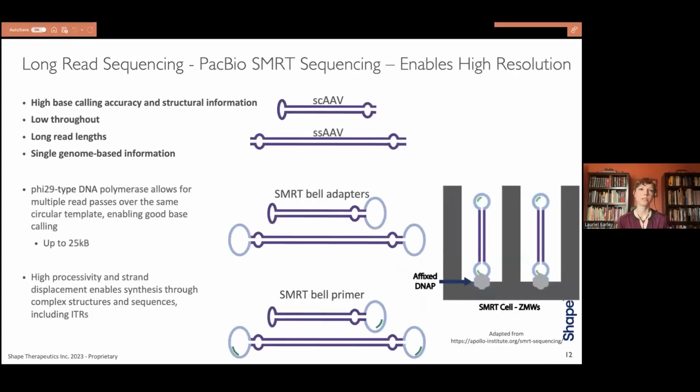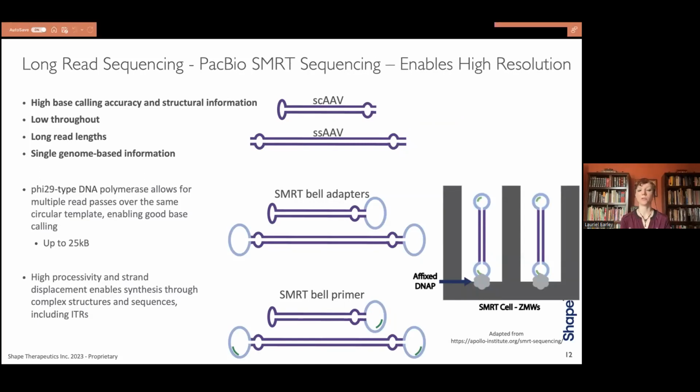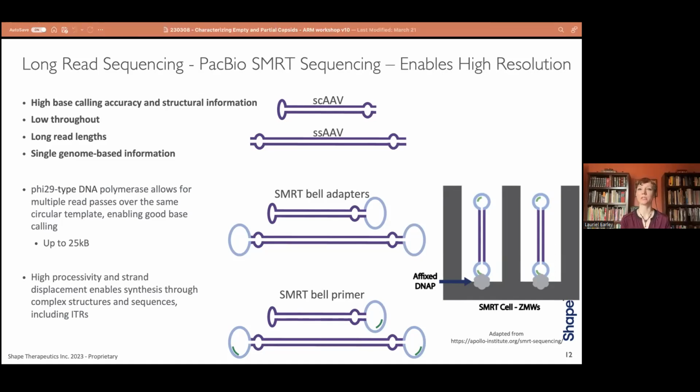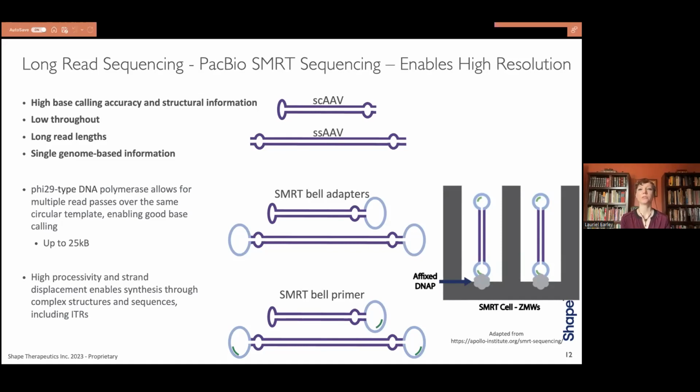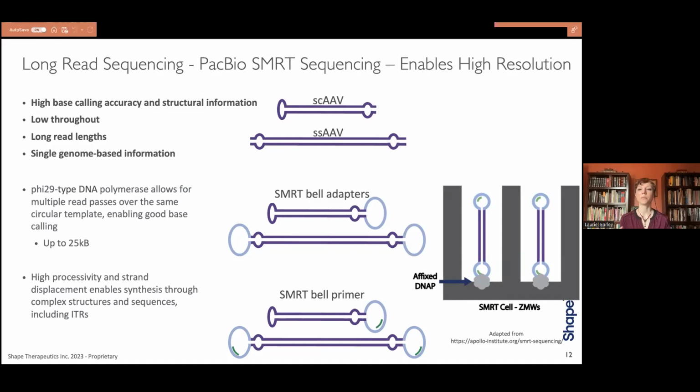The other long-read sequencing technique that I'll actually talk quite a bit about is PacBio's SMRT sequencing platform. And again, this is going to involve adapting double-stranded DNA. I didn't mention this before, but to point out here, AAV, either in its self-complementary AAV form or in a single-strand form that has annealed to its complement, can create double-stranded DNA ends that could be adapted both for nanopore and for PacBio. And so here, these double-stranded DNAs are adapted with SMRTbell adapters to form a circular template that is loaded into a SMRT cell with primer addition.